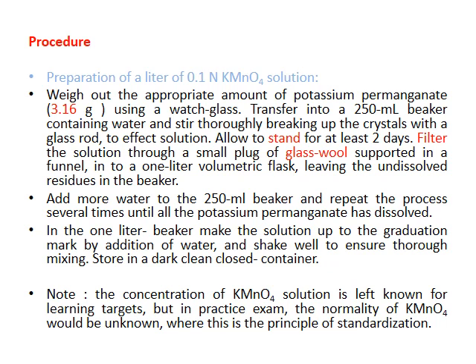Add more water to the 250 ml beaker and repeat the process several times until all the potassium permanganate has dissolved. In the 1 liter flask, make the solution up to the graduation mark by addition of water and shake well to ensure thorough mixing. Store in a dark, clean, closed container. Note: the concentration of the KMnO4 solution is left known for learning targets, but in a practice exam, the normality of KMnO4 would be unknown, where this is the principle of standardization.